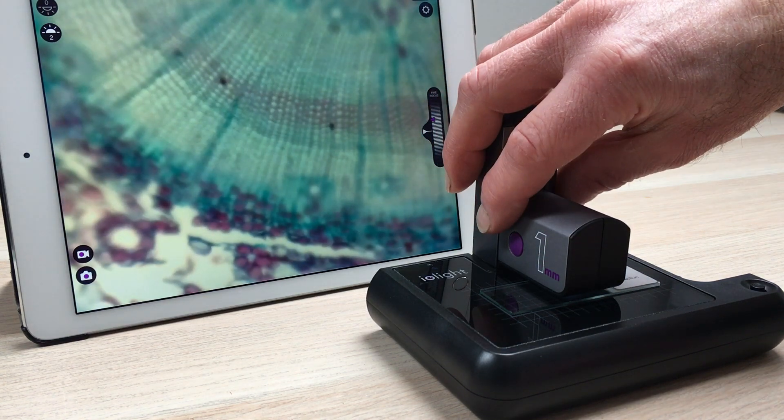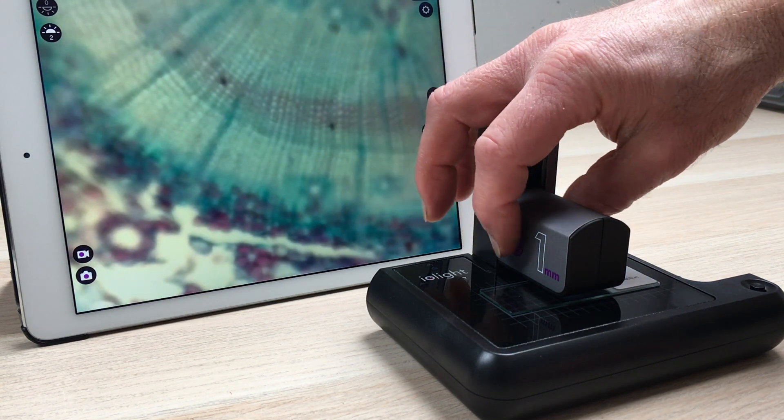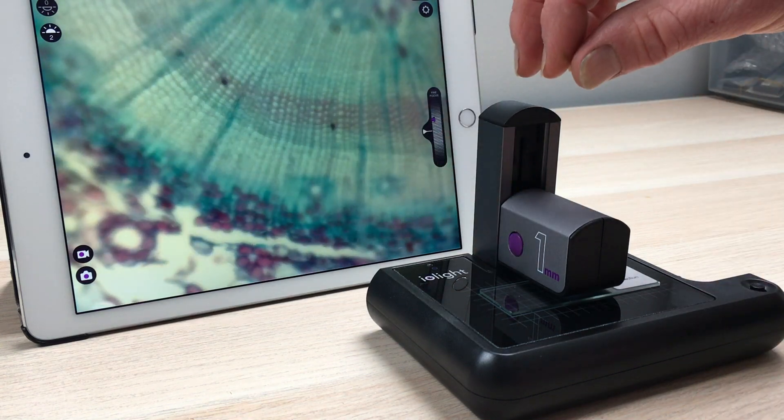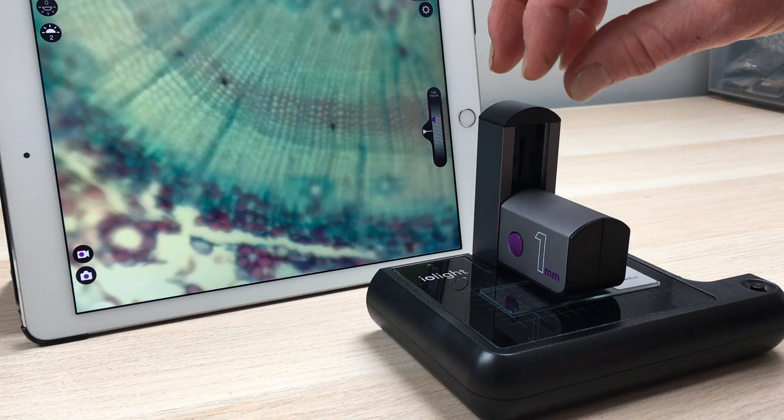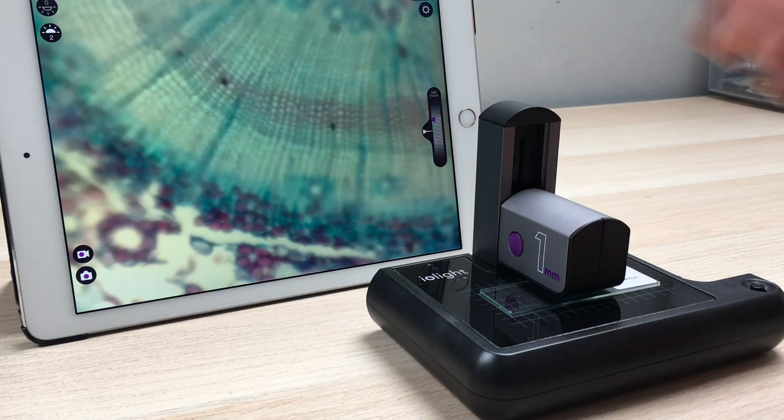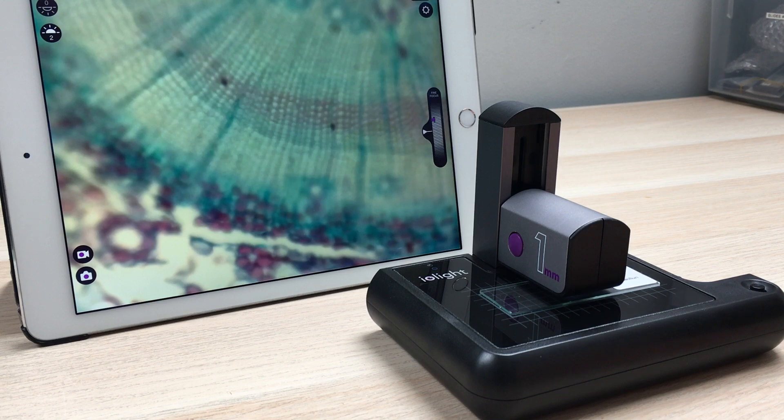The final thing to say is you don't need to push these purple buttons. They're not necessary for focusing. I hope that was helpful and thank you very much for watching.